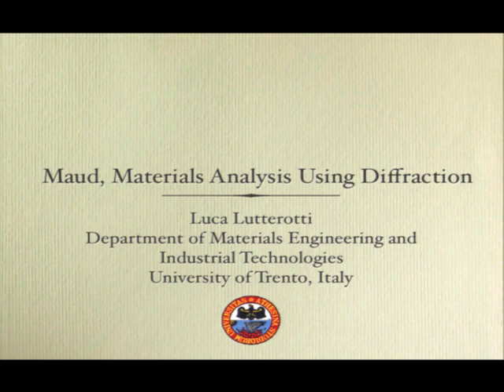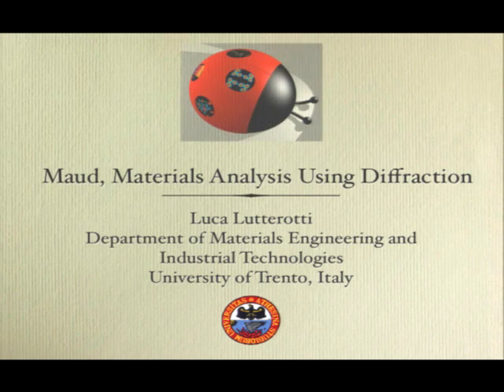And then in the workshop, I will concentrate instead on something starting from an image, and we will do the Montmorillonite analysis I showed yesterday in the quantitative analysis lecture. So starting from the image, integrating it, we will see a little bit of structure in which we need to put these octahedra and refine their position and occupancy, and we can also go through how we deal with texture on it. Okay, so let's go further.